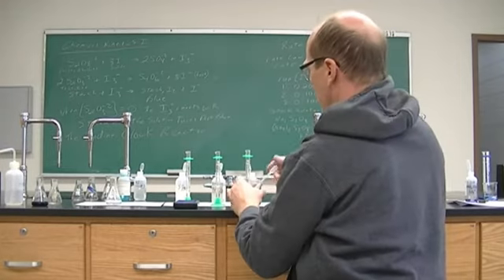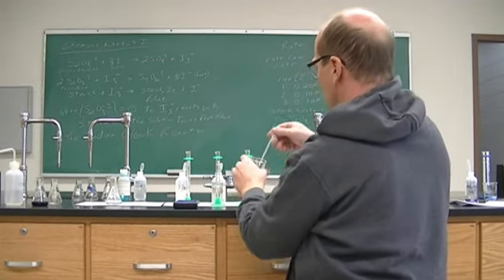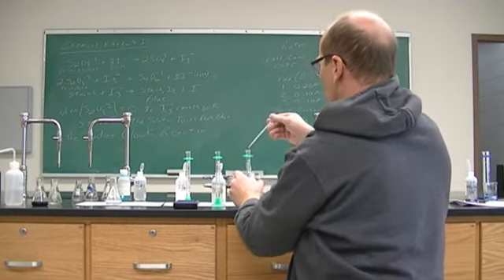0.1 molar KI again, so I don't need to thrice rinse this. It is again 0.1 molar KI.